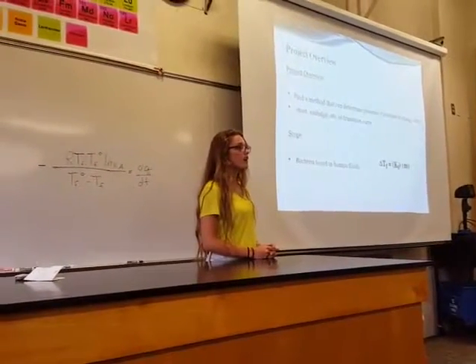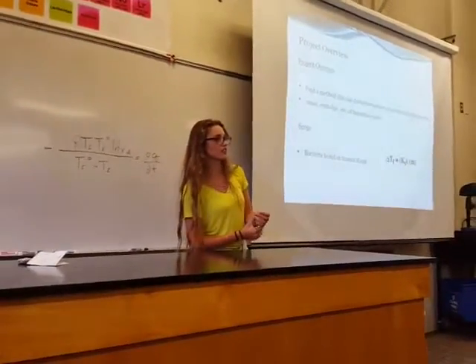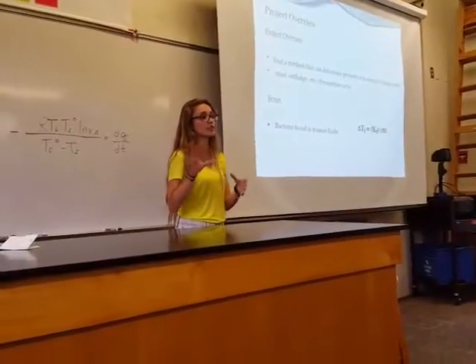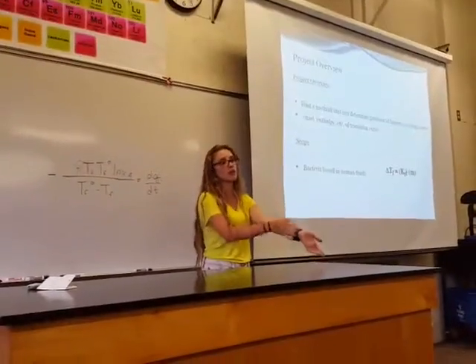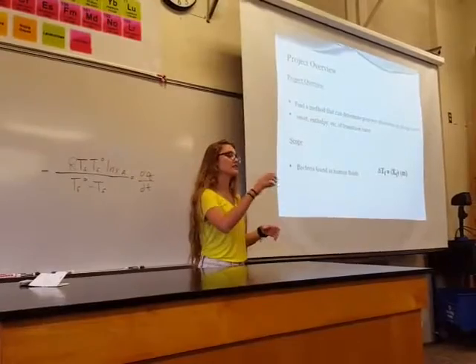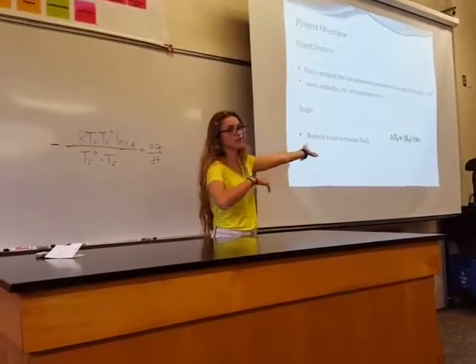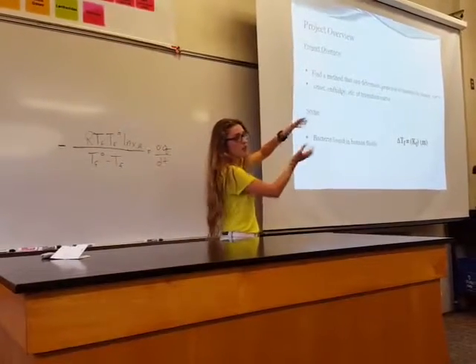Is that the idea? If I understand your question correctly, if applied to an actual clinic, the idea would be to pull out a milliliter of blood sample from a person who shows these symptoms, take 20 microliters of it, put it in a sample, and run it on the differential scanning calorimeter to create what was for us our LB samples.